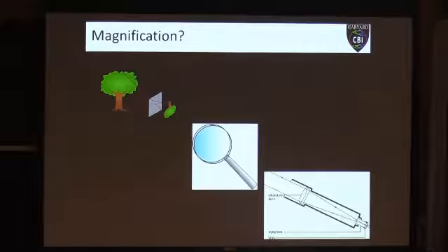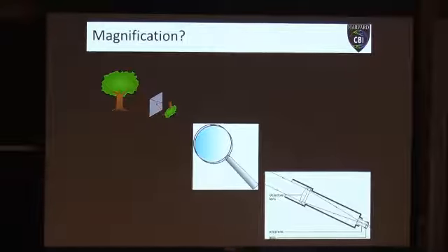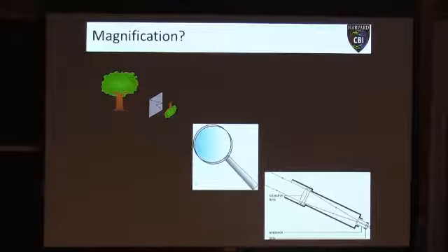All right. So what I've done here is I've shown you three very simple examples of how to get magnification. We looked at the pinhole camera that doesn't even use a lens. We looked at a magnifying glass that just has a single lens. We looked at a telescope, which has two lenses. Any idea which one of these is what's going on inside your microscope? It's a trick question. None of these are going on inside, at least not in your modern day microscope.